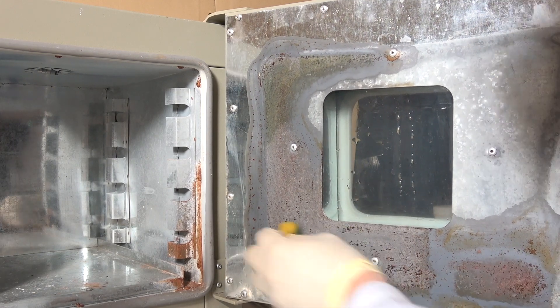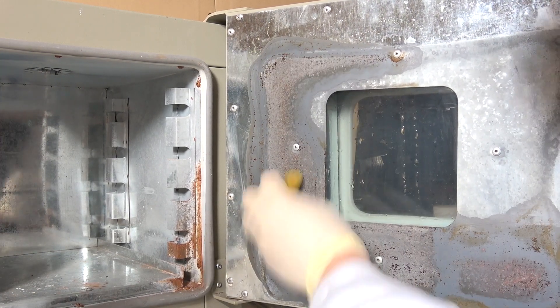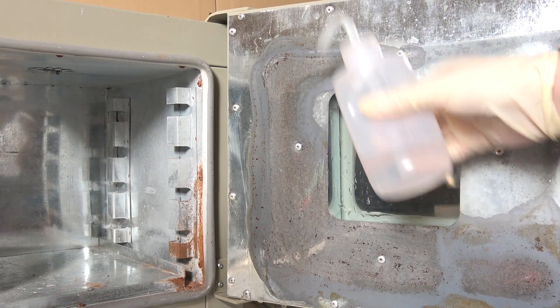The surface is then wiped with a sodium carbonate-soaked sponge, rinsed with a copious amount of water, and thoroughly dried.